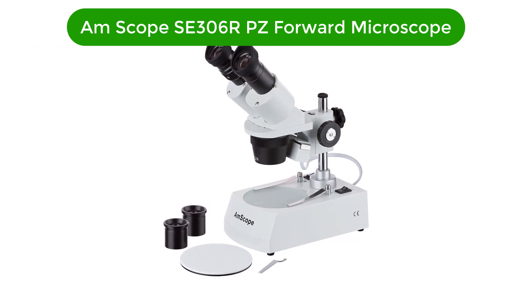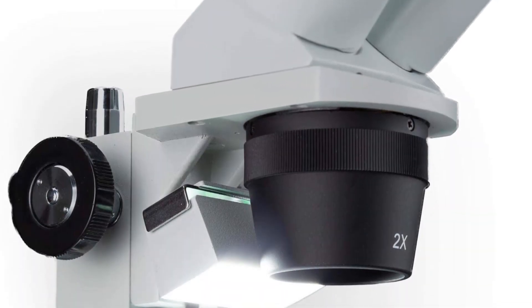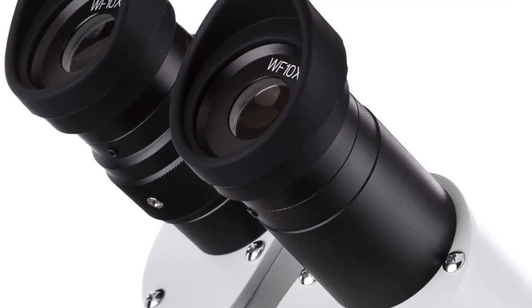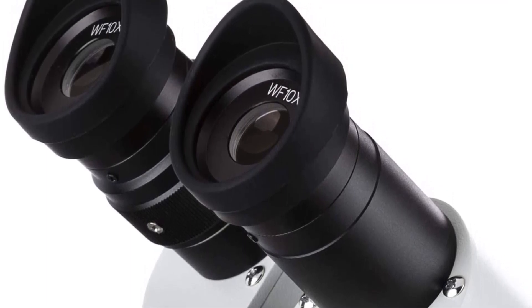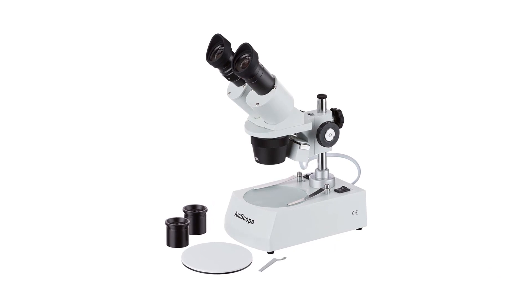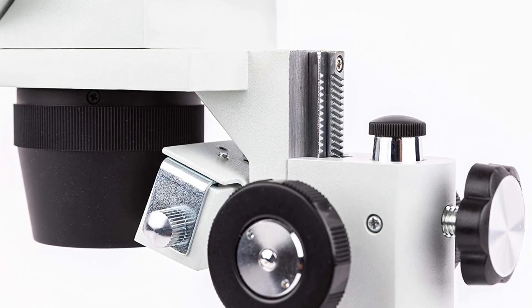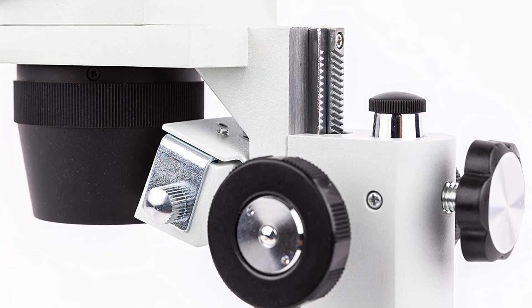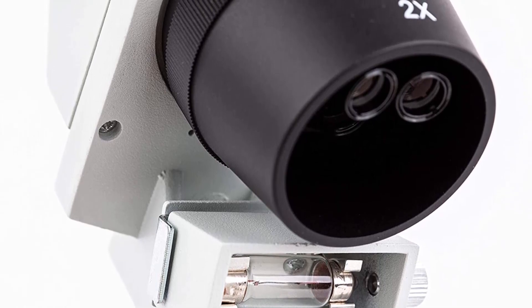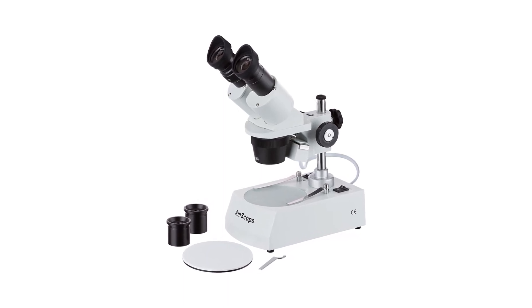Number two, our second best pick is the AmScope SE-306-RPZ Forward Binocular Stereo Microscope. This is a versatile and powerful tool for professionals and hobbyists alike. With its 10x to 80x magnification, WF 10x and WF 20x eyepieces, and 2x and 4x objectives, it offers unparalleled clarity. The upper and lower halogen light sources provide bright, clear illumination for even the most challenging specimens. The white pillar stand is stable and adjustable, and the unit runs on 120V power.